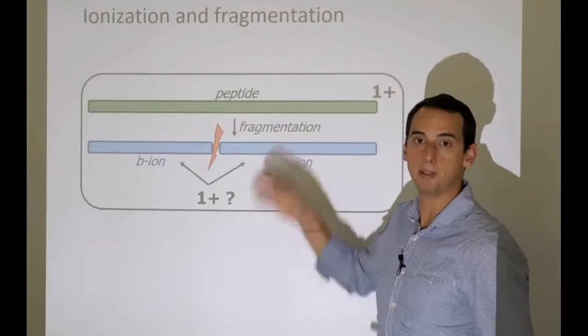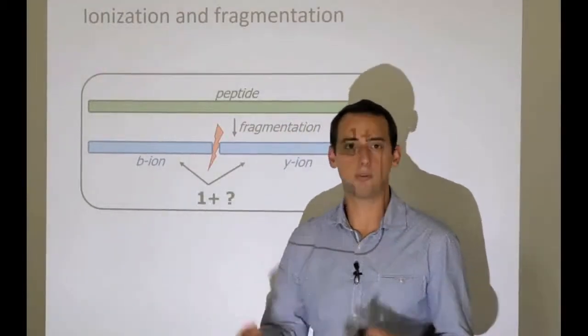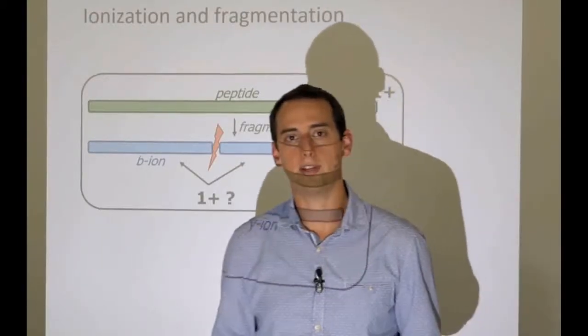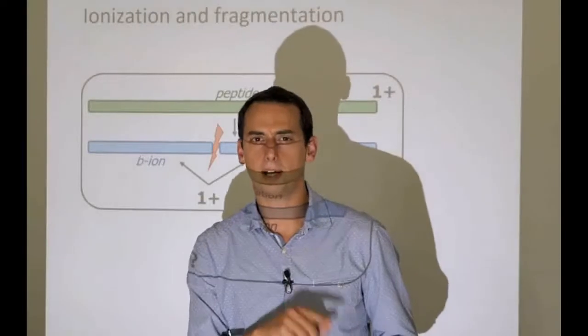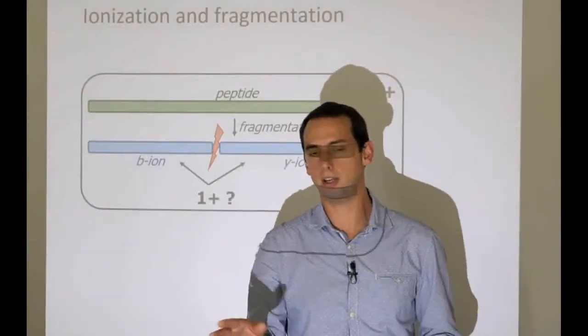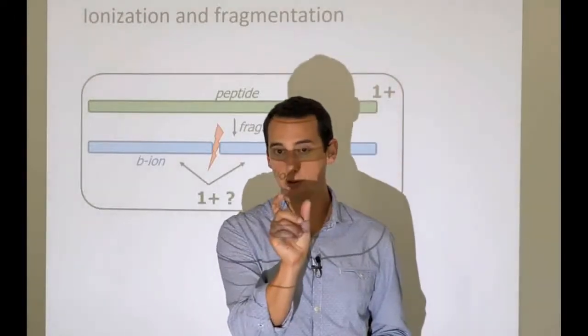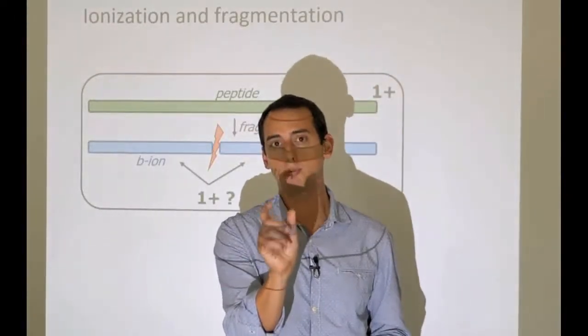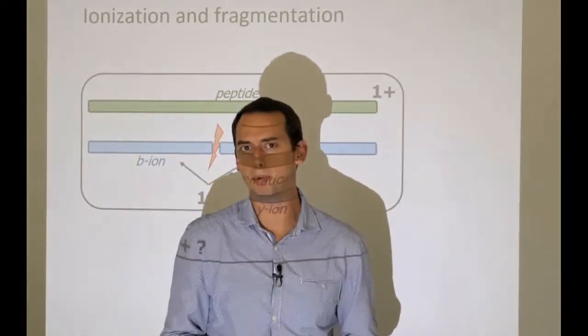So that was really great because we didn't have to worry about the charge state assignment. In electrospray we could have 2+, 3+, 4+ charge states, and that would be really difficult to sort out later. Then again, we learned that with high resolution instruments, which is essentially anything apart from an ion trap these days, we can look at the isotopes, and the distances between the isotopes will reveal the charge state. So it wasn't quite as big a problem anymore.